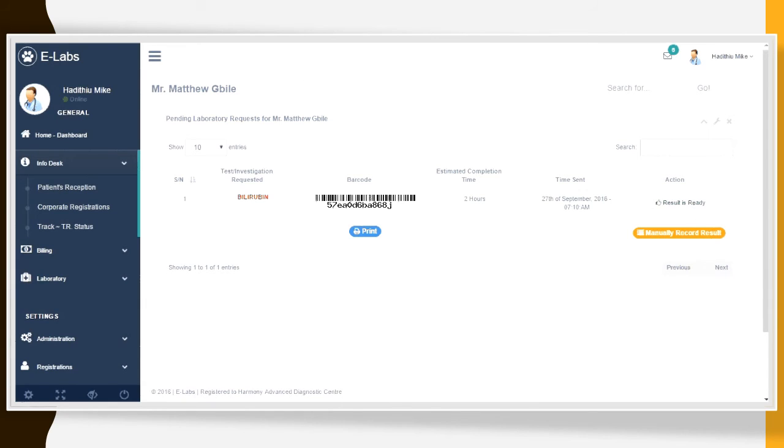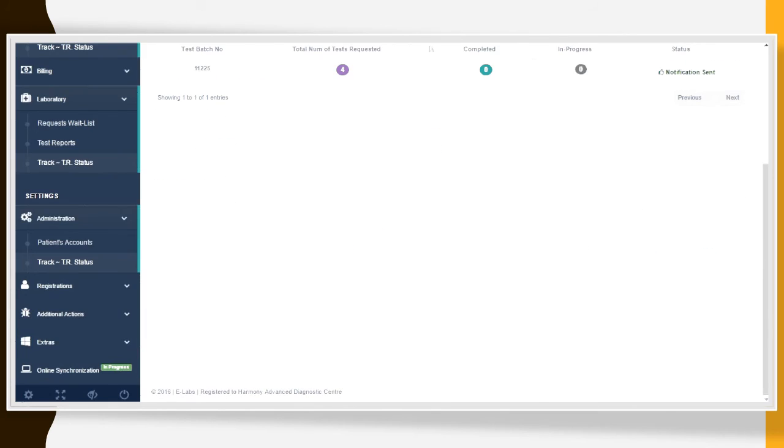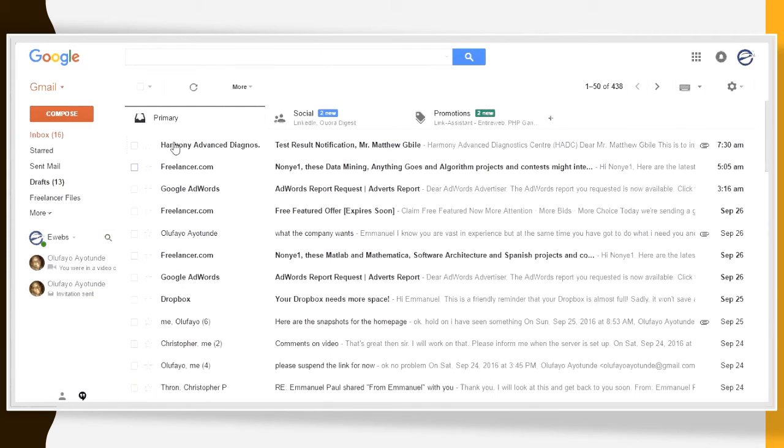So all things being equal, I should get my results immediately after that has been sent. So we are just going to track the result again for Mr. Matthew Billy. So we go. You can see the notification has been sent. So if all things are equal, we can check my inbox.